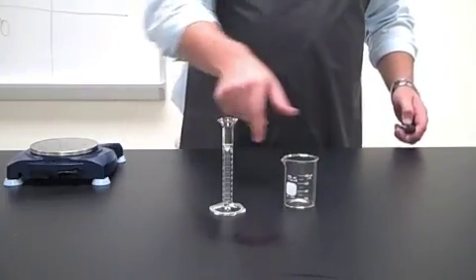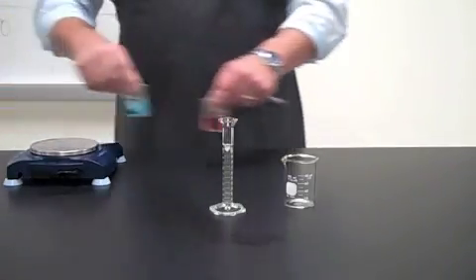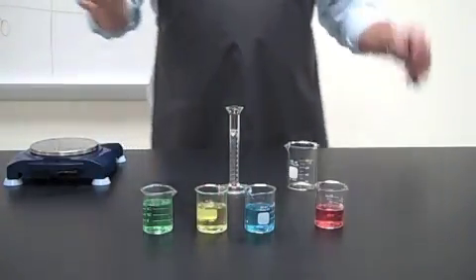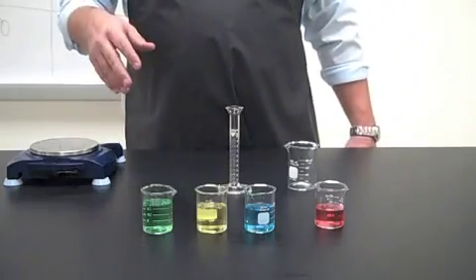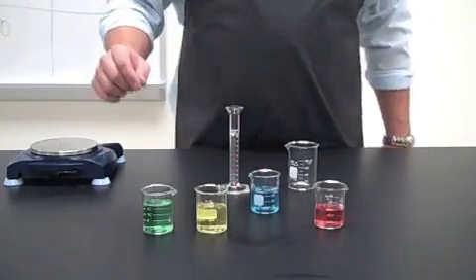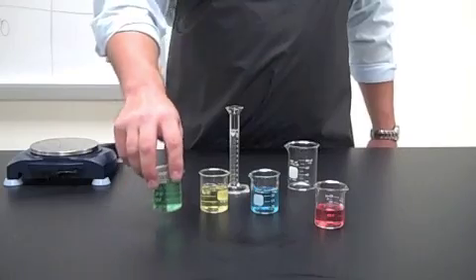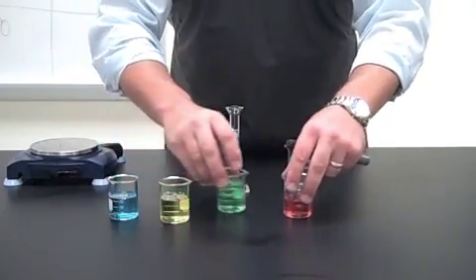Next piece of material, we need a 100 milliliter beaker. And then we're going to have 4 reference solutions that we're going to be using throughout the lab, all right? Our reference solutions have a mixture of distilled water and sugar, and they have a % of sugar per color. The first color, blue, is going to be our smallest percentage. It's going to have only 5%, and then our yellow is going to have 10%. Then our green will have 15, and then our red will have 20. So we'll kind of switch these around to go from low to high.